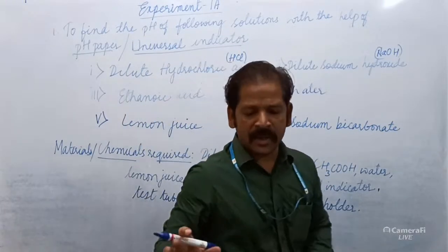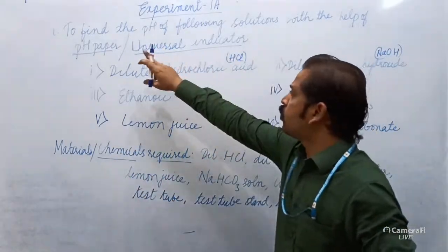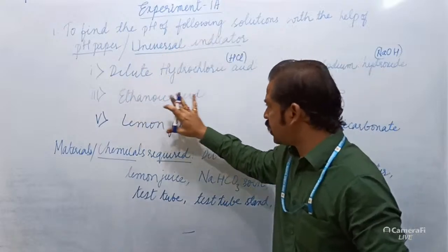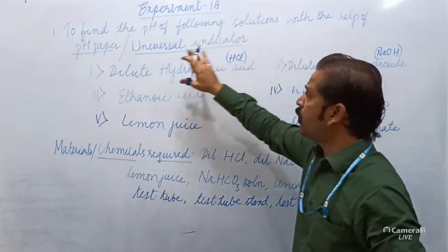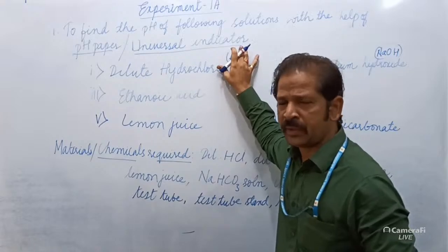These are the materials required for this experiment to find the pH of these six solutions with the help of universal indicator solution.